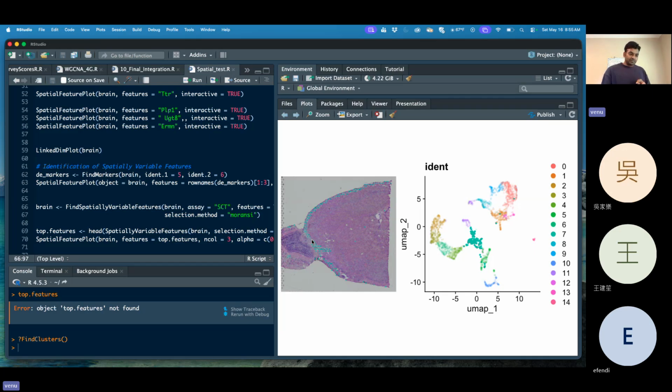The next step is what kind of cells are present in each spot, at the spot level. Now we have these spots all belonging to one group, but what proportion of cell types do they have within the spots? That is what our deconvolution method will reveal. As I said, up to here there may be fibroblasts plus epithelial cells. Epithelial cells, for example, are the top marker, so that defines the groups, but there are layers of cells.